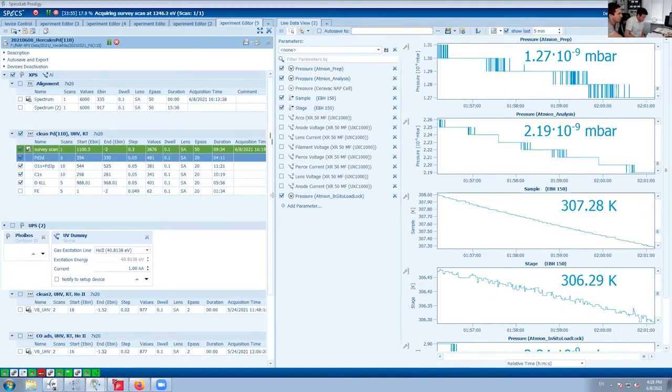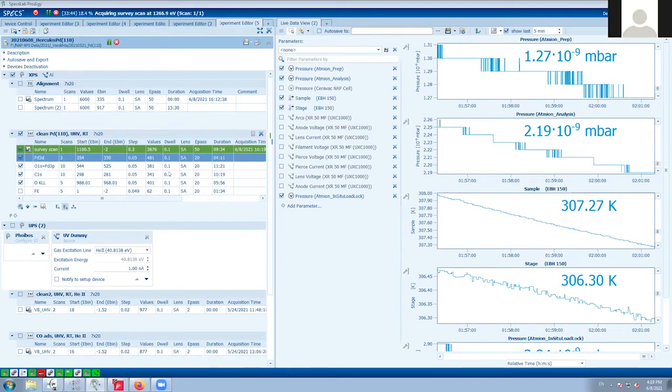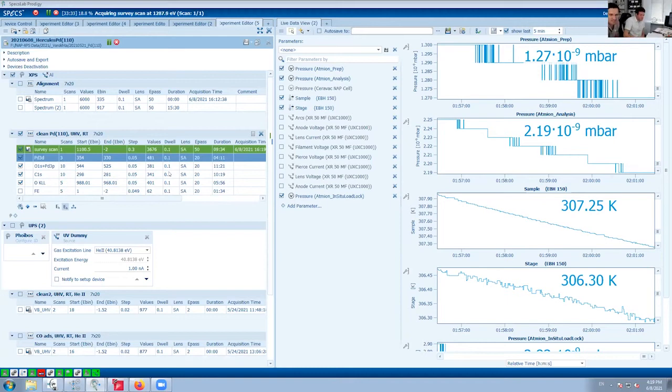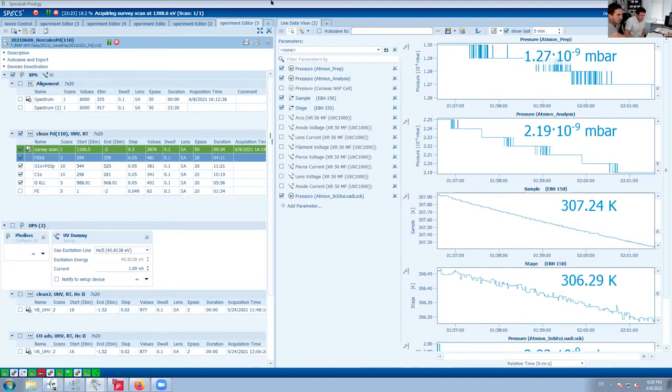So for example, we prefer to use a lower dwell time, like 0.1 second or whatever, but more scans. Some people use a longer dwell time, but one scan. I guess this is the same. With more scans and smaller dwell time, you get the same quality of data, because what is important is only the time of measurement.